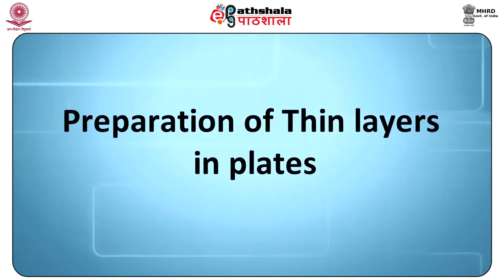Preparation of thin layer plates. While preparing a TLC plate, the primary requirement is that the layer should be consistent throughout the plate. To meet this criterion, a large number of applicators are available at a commercial level and are used for coating glass plates with diverse adsorbing materials of even thickness. Most of the methods use the coating material in the form of a slurry or a suspension in some liquid.